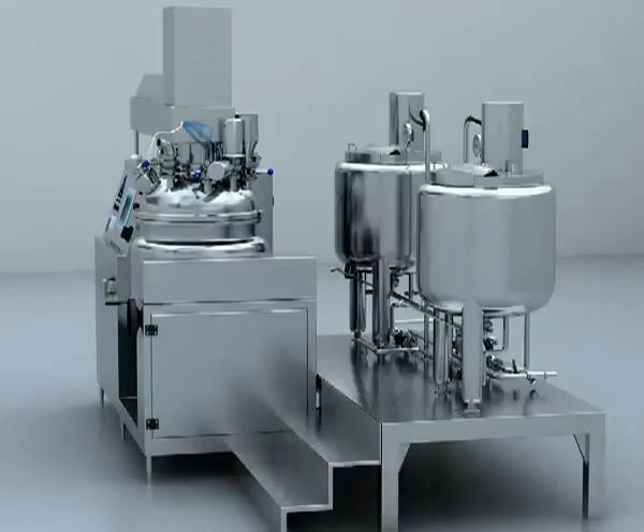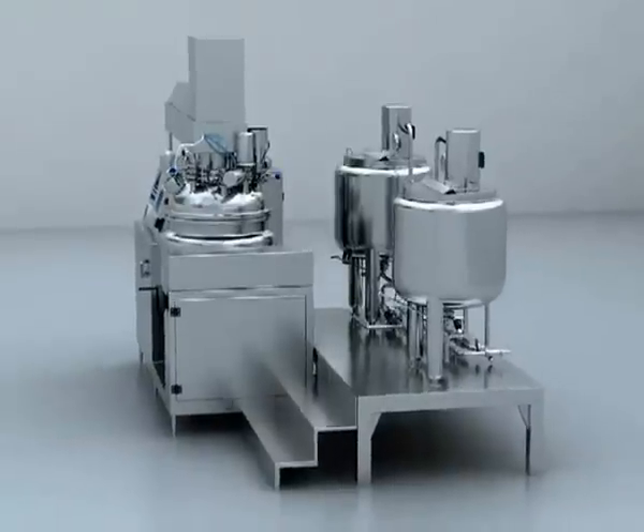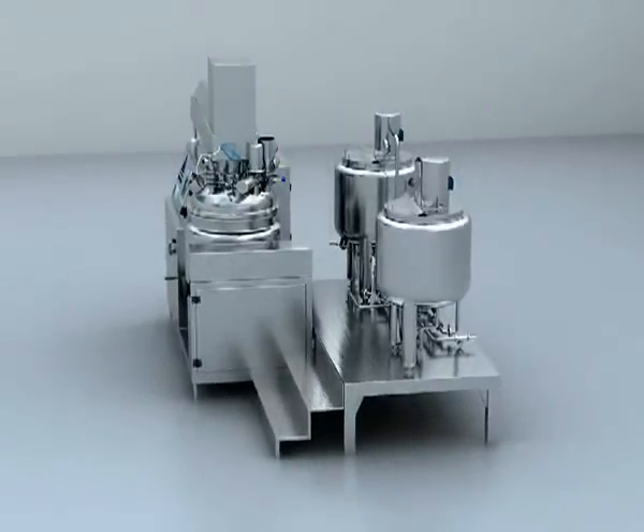3. Connect the stainless steel pipe and compressed air pipe between the main machine and the working table, and the wire between the main machine and preparation tank room. 4. Connect the steam pipe, water inlet pipe, water discharge pipe, condensed water discharge pipe, compressed air inlet pipe, and wire between the workshop and the immersifier.